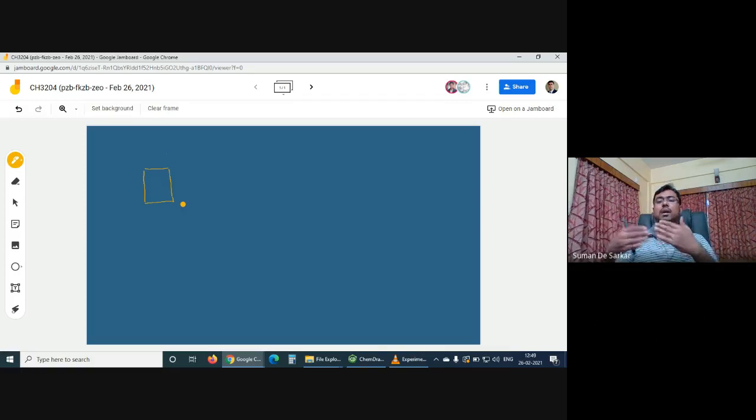Aluminum wraps are very flexible, not rigid, but this is a little bit thicker, so it's a firm and rigid little plate. And above that, there is a layer of silica, SiO2, with some other components, so that it sticks on the surface of this aluminum plate.